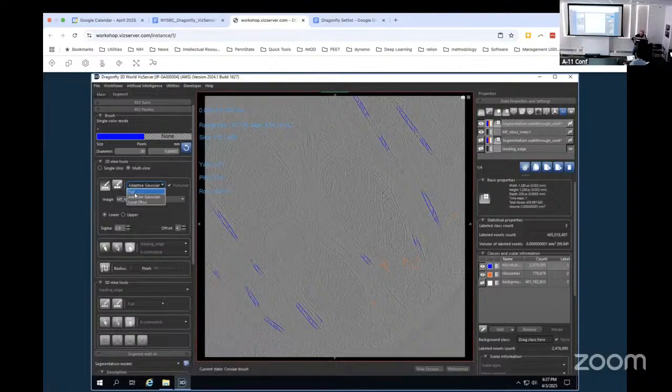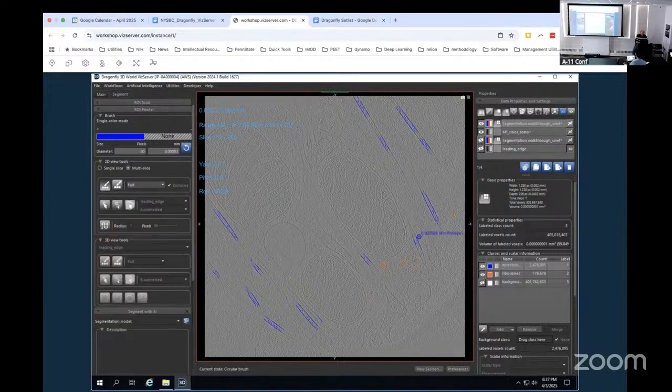If you wanted to selectively remove just the signal, use adaptive Gaussian. Basically, holding shift, I forgot to say this, remember how you were holding control to add? Holding shift removes. Oh no, I thought it was about to crash. Yeah, so see, if I go over that, it just erases that microtubule.